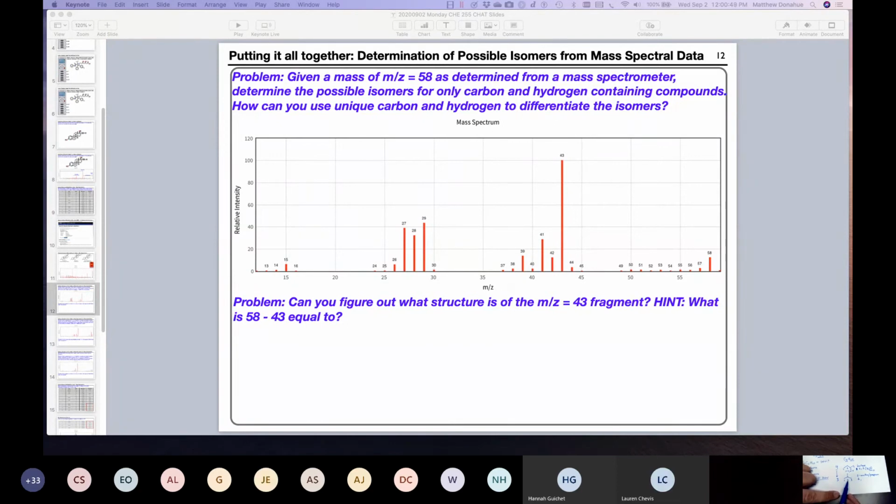So let's do the same exercise for 2-methylpropane. I know we're going to go a little bit over, but if you just bear with me, I'd like to finish this slide before we adjourn. How many unique sets of hydrogen do you see? There's 2, right? You have methyl, methyl, methyl, and then methine. So what are the ratios for those then? 9 to 1: 3, 6, 9, and then 1.